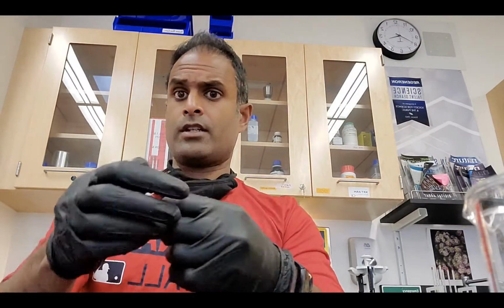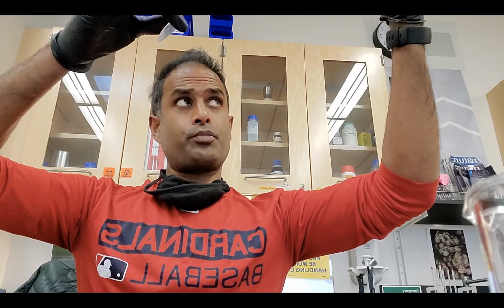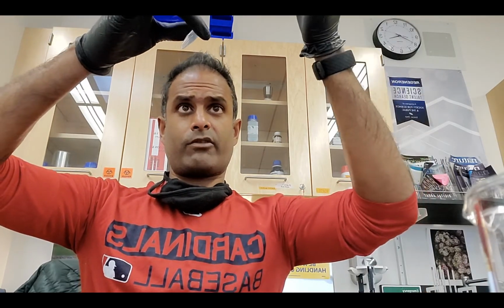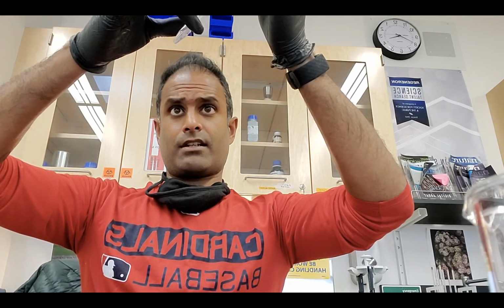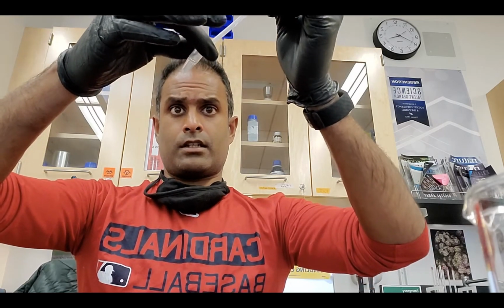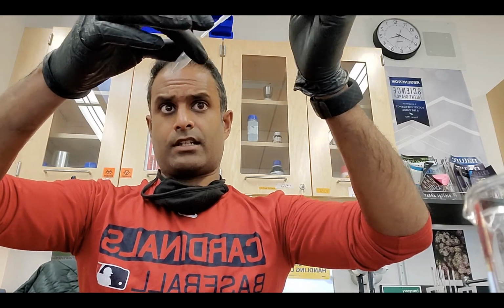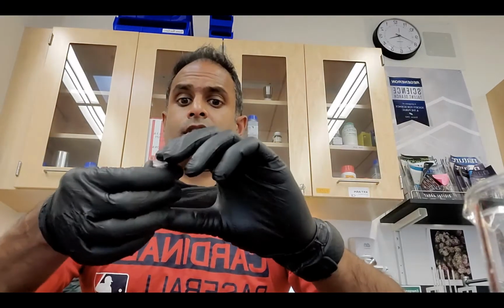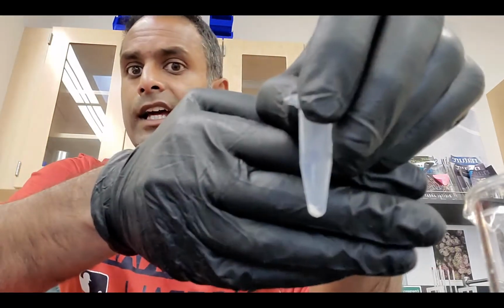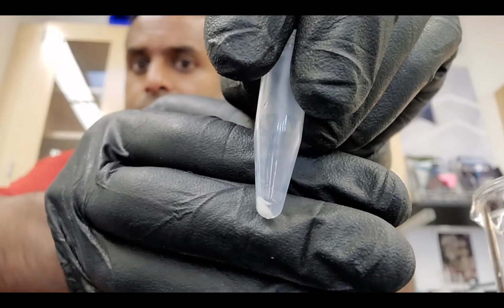So what I'm going to do is take my tube with my pipette. Now I'm going to hold my tube at about a 45-degree angle at eye level, push down on my pipette so that I'm ready to suck up some liquid. I'm going to go ahead and suck it out, and keep doing that until I have pretty much just the pellet left. So there's no liquid in there. You can see there's just a tiny bit, and that's quite all right.